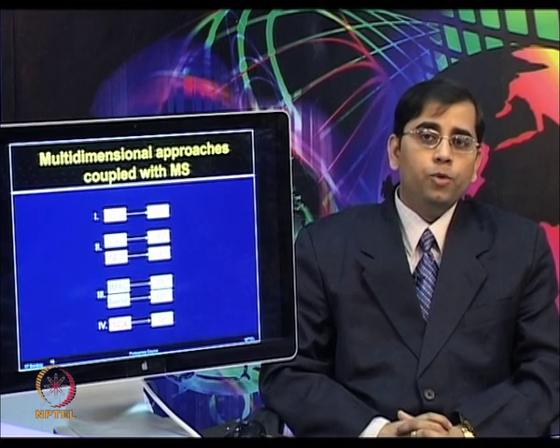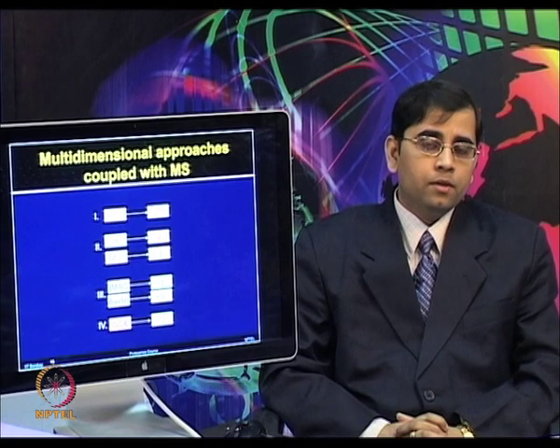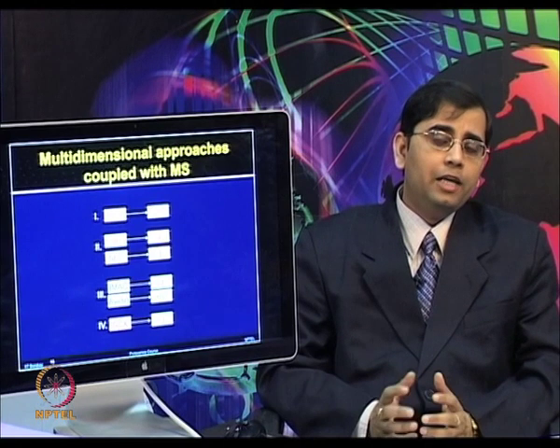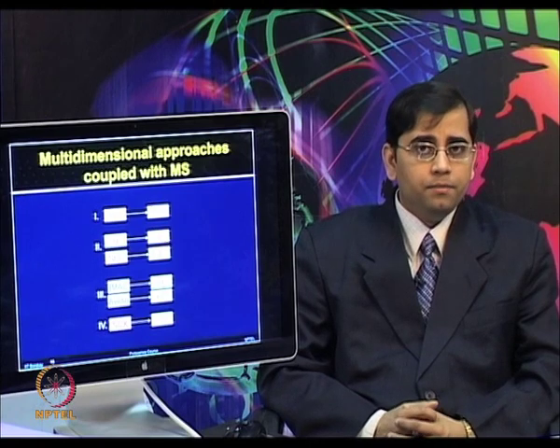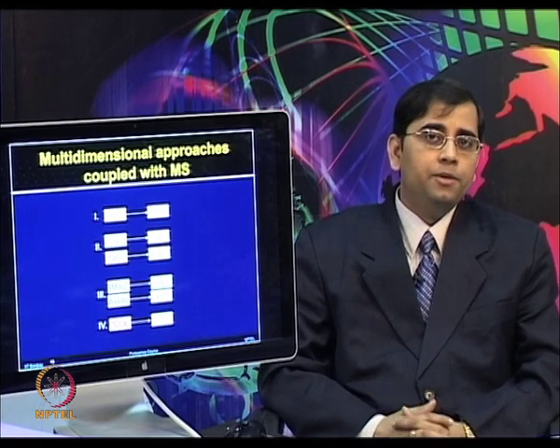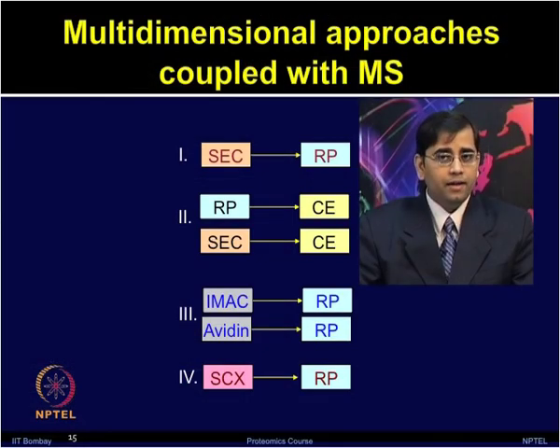Now, multidimensional approaches can be coupled with mass spectrometry. So, one can use various types of liquid chromatography methods in tandem and then do the multidimensional separation. Different approaches have been tried.